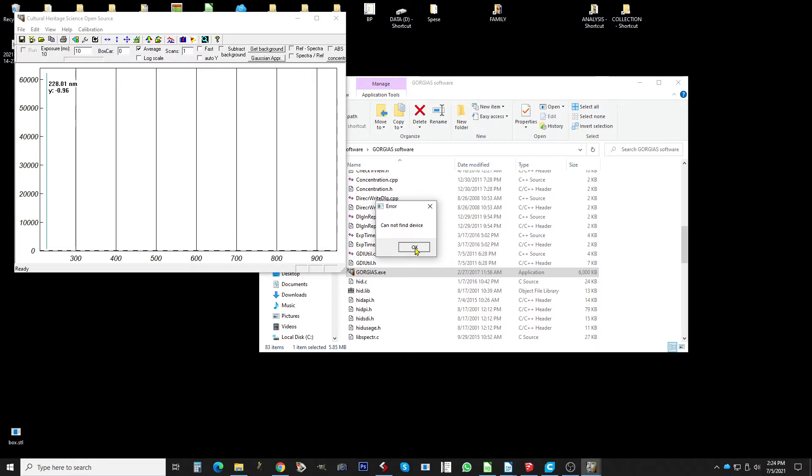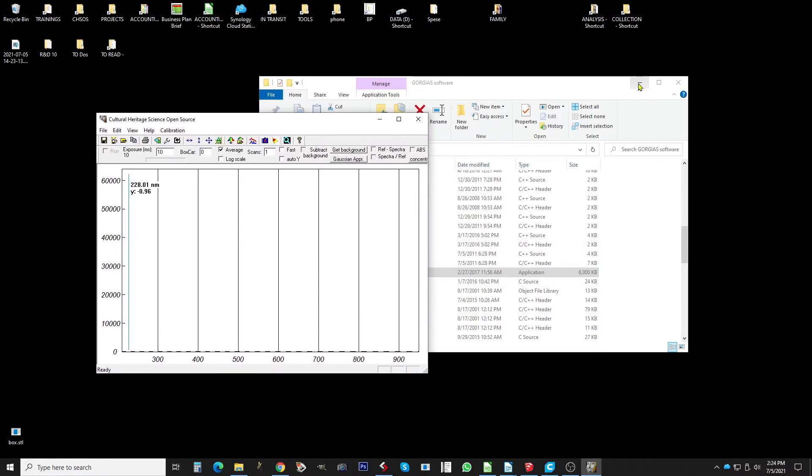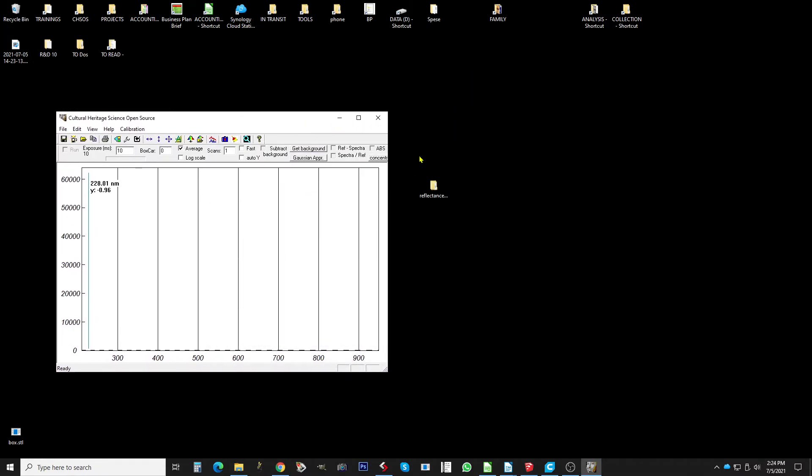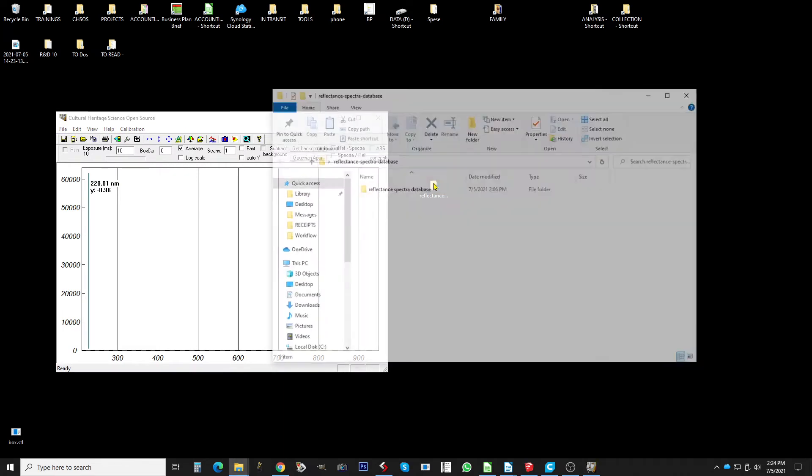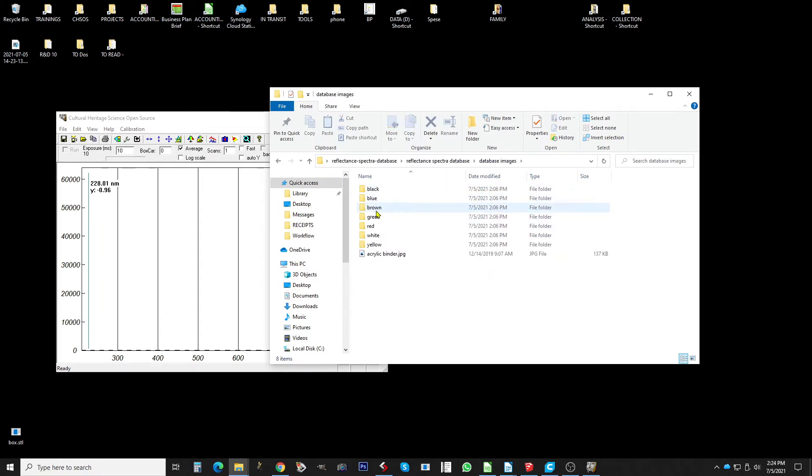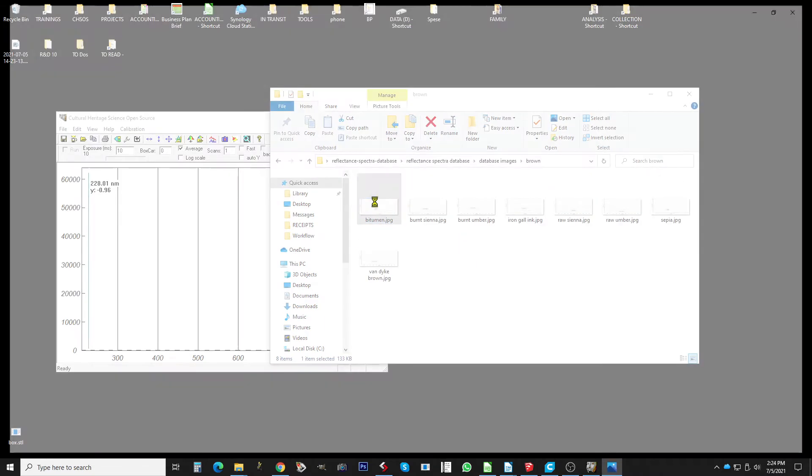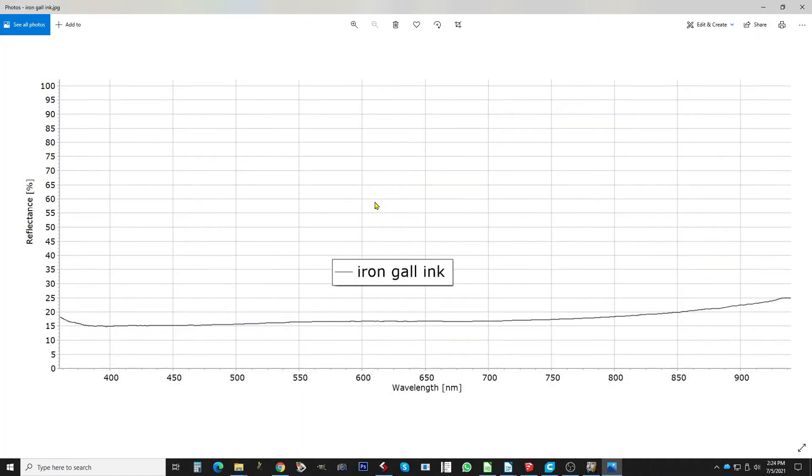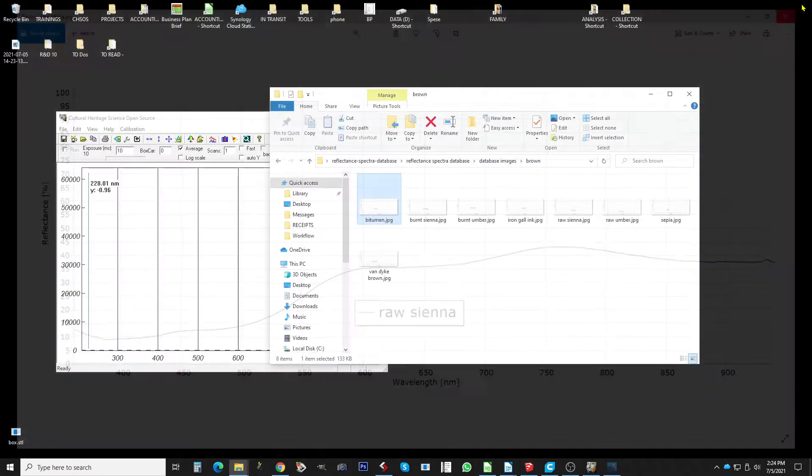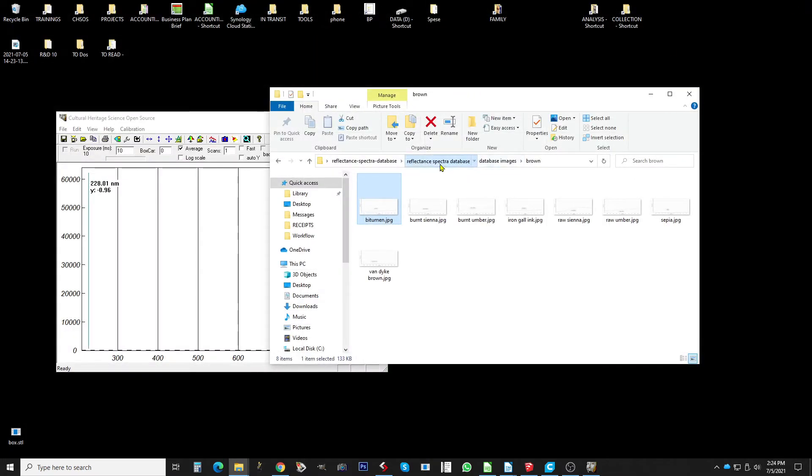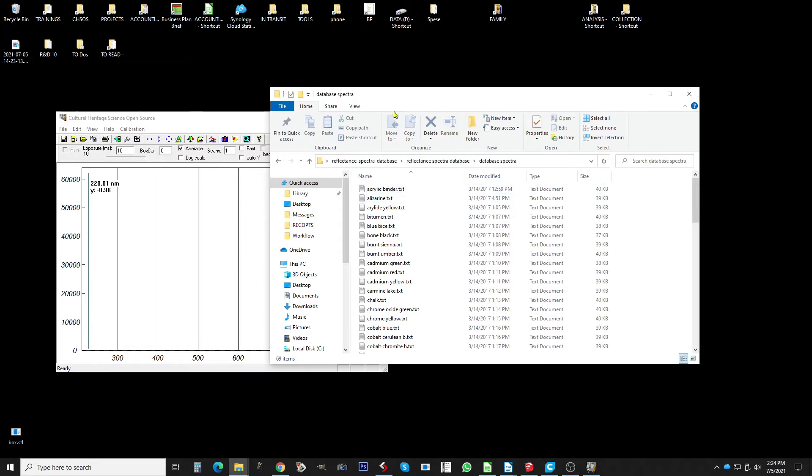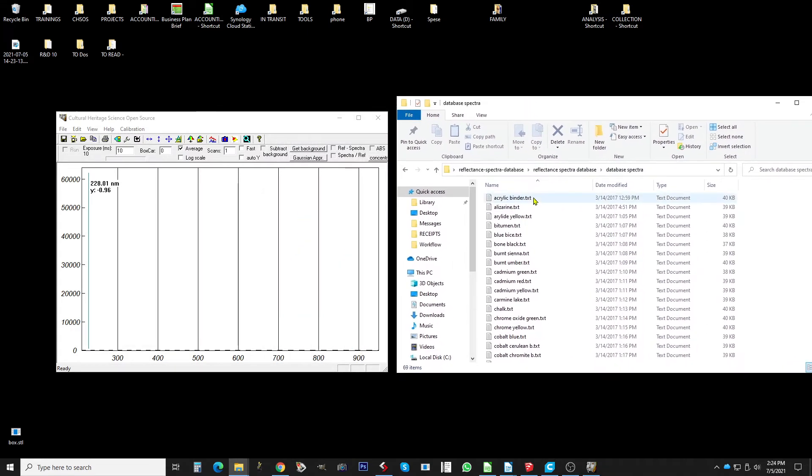Of course there is no spectrometer attached to this computer, so you can click this one okay. Then we go into this reflectance spectra database. It was already in a zip format so we unzipped it and there we are, database images. Here I just saved the images, just the jpeg, because I like to have them to have a look, remember what's the shape of the spectra. So we go back here, we have a database spectrum and here are the spectra.